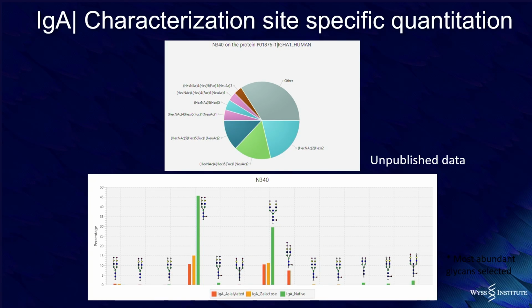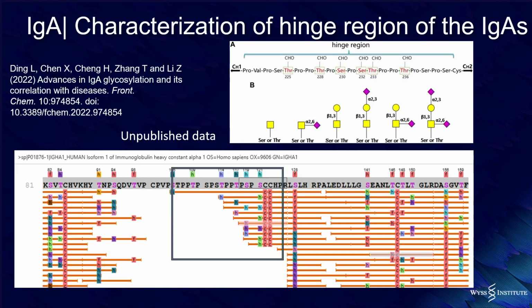As well here, totally another side. Again, a representation of the sugars. Those are changed, those are not changed. And again, we're still speaking about one protein. There are no other things. I have not switched. This is just 3 samples being done, each in 30 minutes of mass spec run. That's it. That's how much data we have now from this particular case.